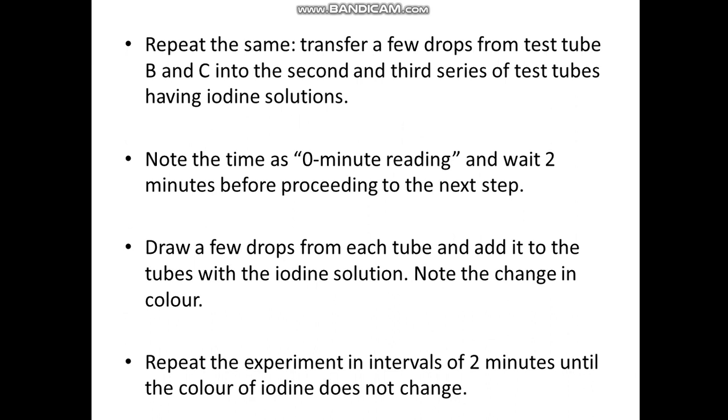You can follow this procedure to carry out this experiment on your own. In the next part of my video I am going to discuss the results.